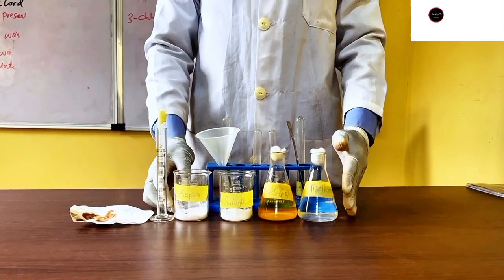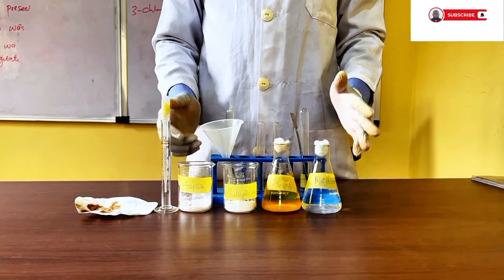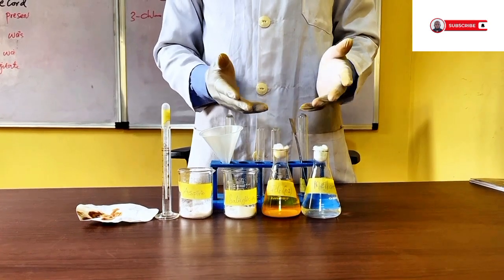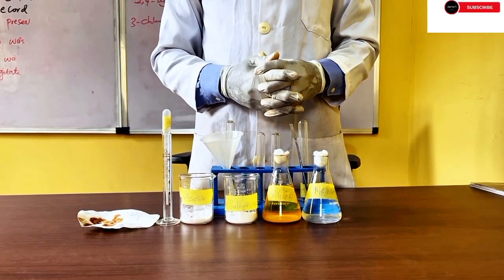So this is the experiment. Let's conduct the experiment. It's just a simple experiment. It doesn't really involve hazardous chemicals.